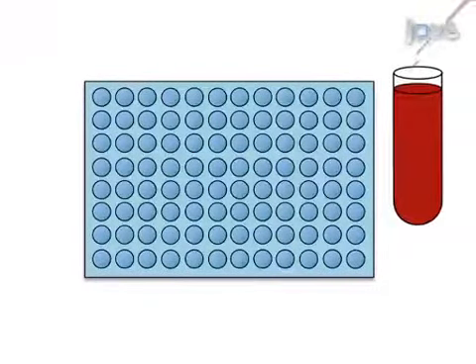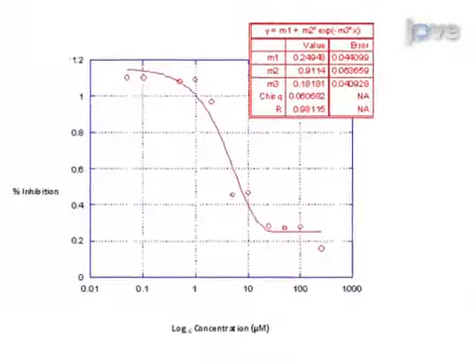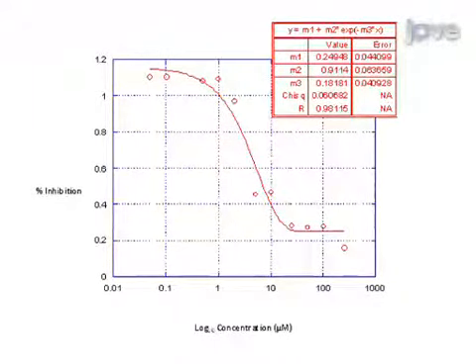The luciferase activity of the virus can then be measured. Ultimately, the luciferase readout signal can be used to quantify the inhibition of the HIV-1 viral vector replication by the compounds.